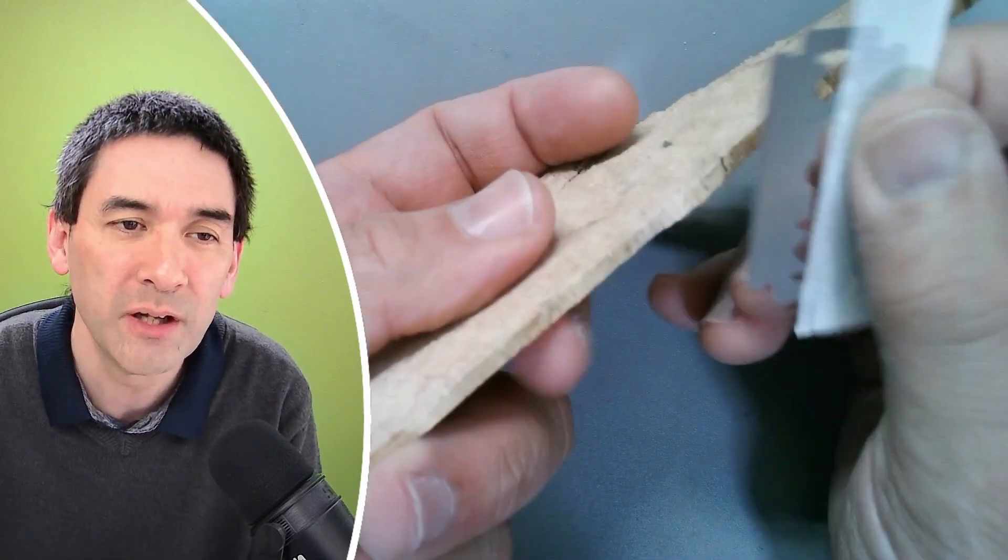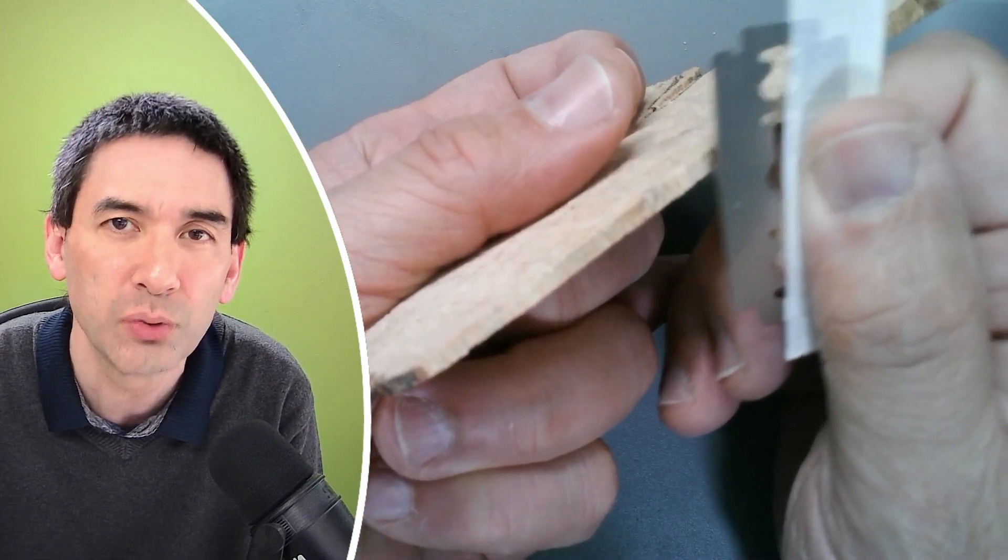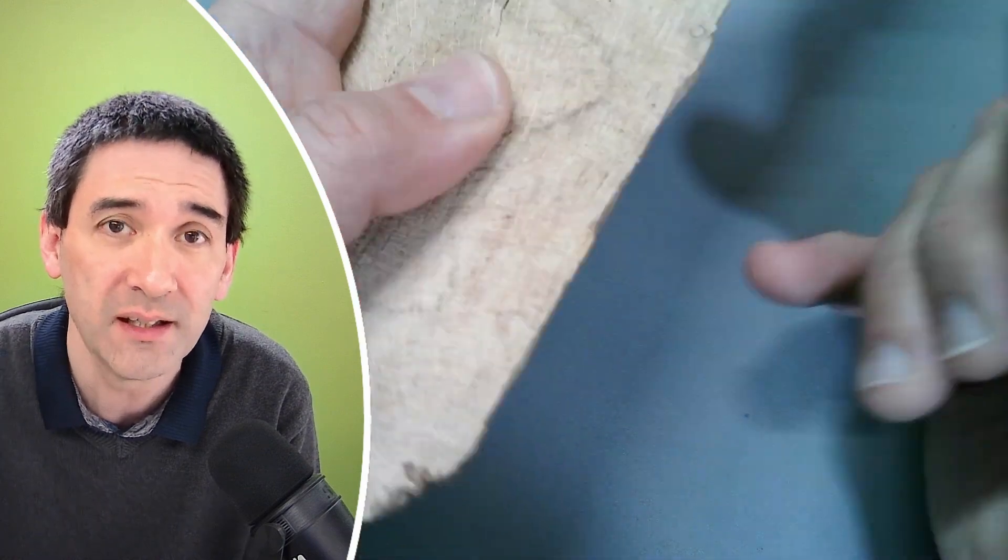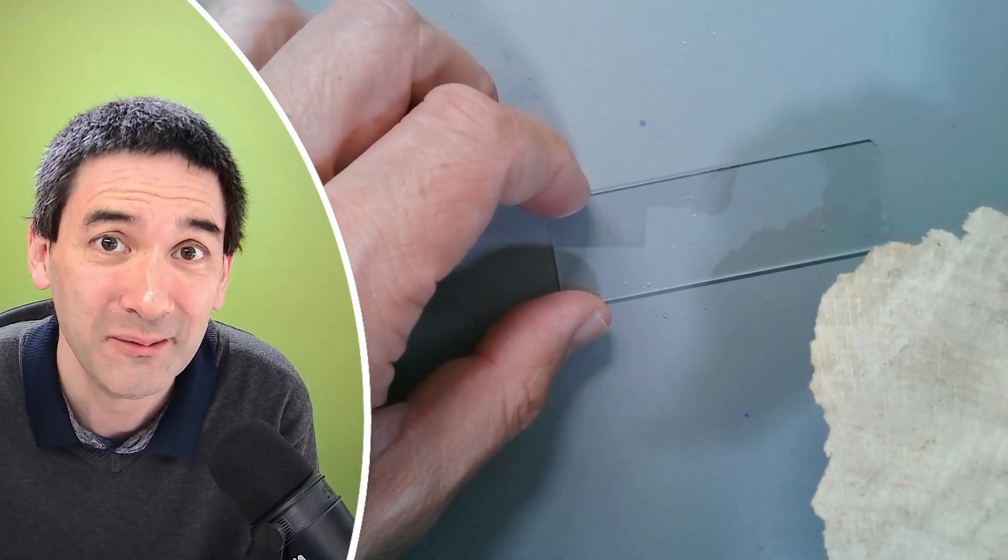I would like to shave off very thin cross sections of the wood in different orientations, like this and also like this. We're gonna collect it on this microscope slide here and then we're gonna put it under the microscope and maybe we're lucky.